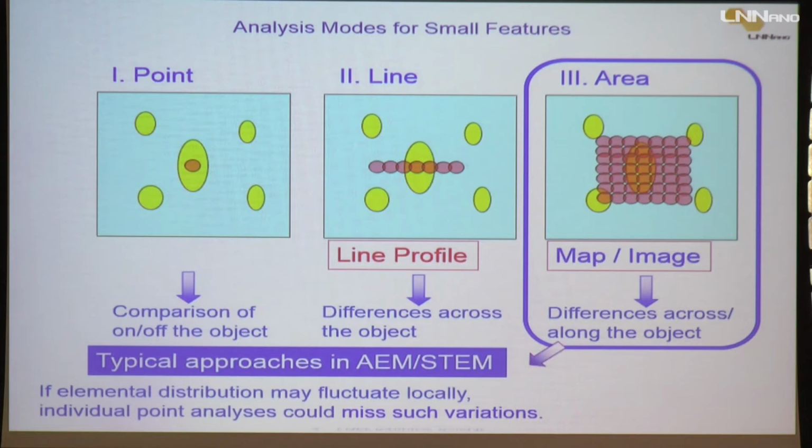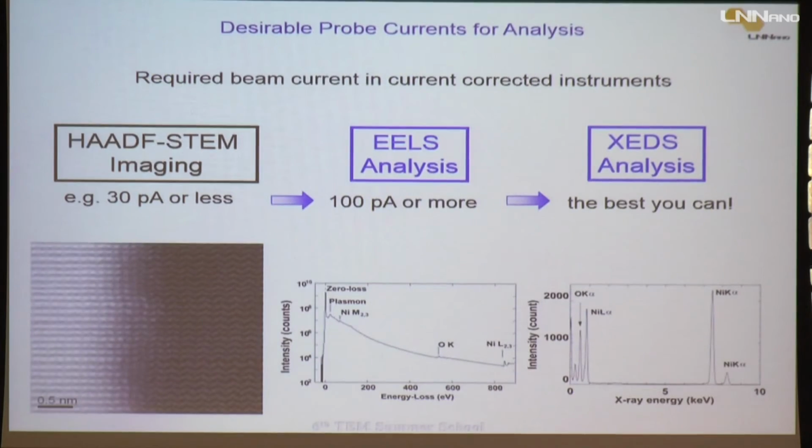You can do mapping with a lot of, not that easy, but it's easy, okay? And then you can acquire all the information in a single experiment. It's very, very interesting to do, okay? And then, well, with this you do everything. Related to the probe that you are using, because you want to do the best image, and in parallel, you want to do the best spectroscopy also, okay?